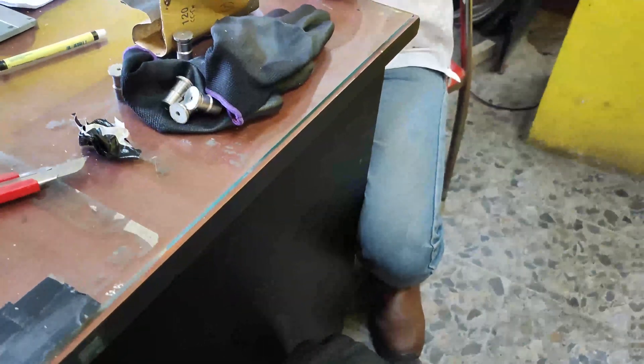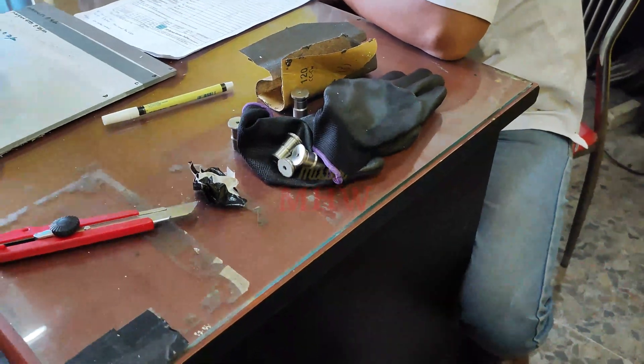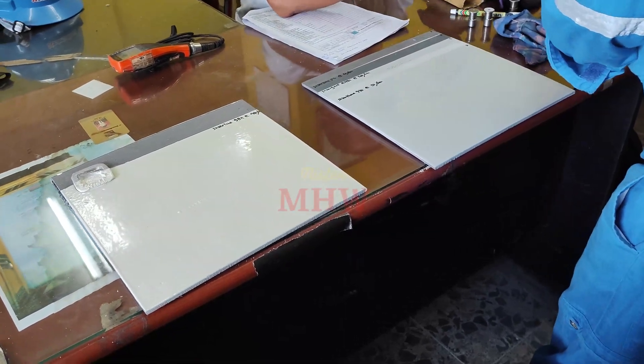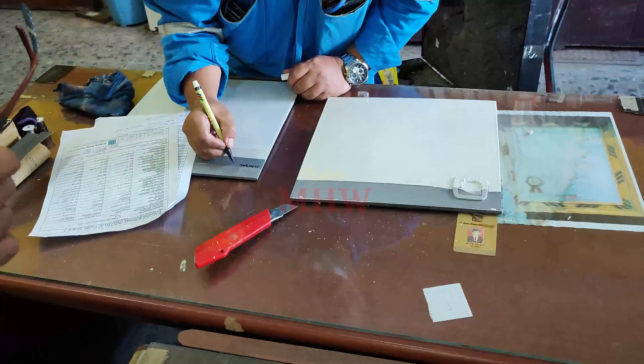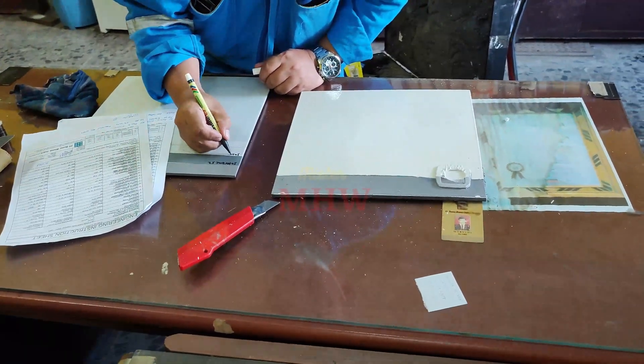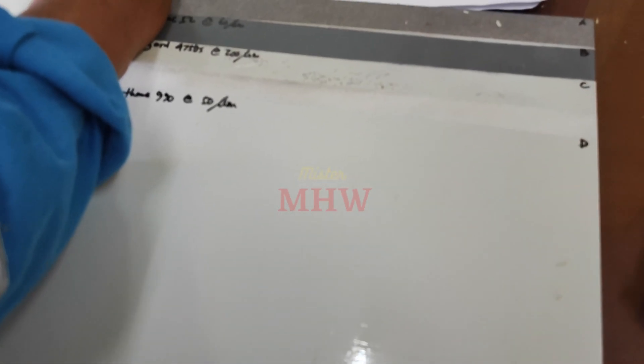In the paint and coating industries, paint adhesion testing is often used to determine if the paint or coating will adhere properly to the substrates to which they are applied. Several tests measure the resistance of paints and coatings from substrates: cross-cut test, scrape adhesion, pull-off test, and others.